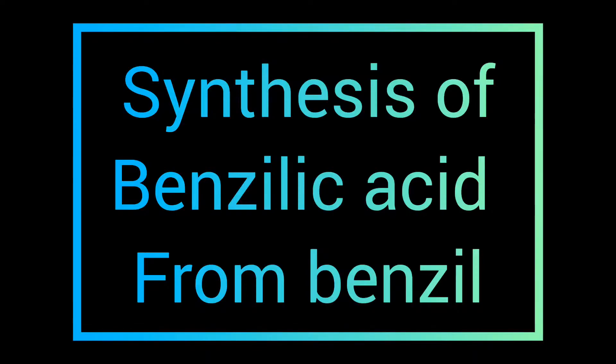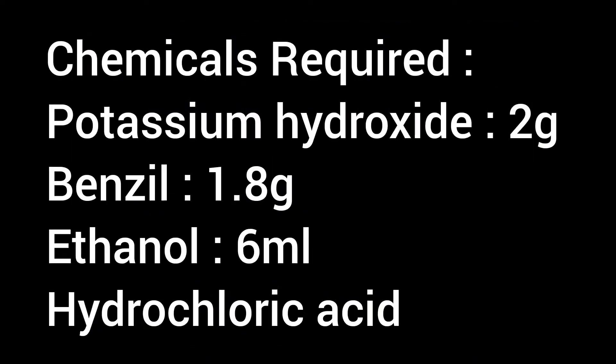In this video, I will be synthesizing benzilic acid from benzil. These are the chemicals required for the synthesis.